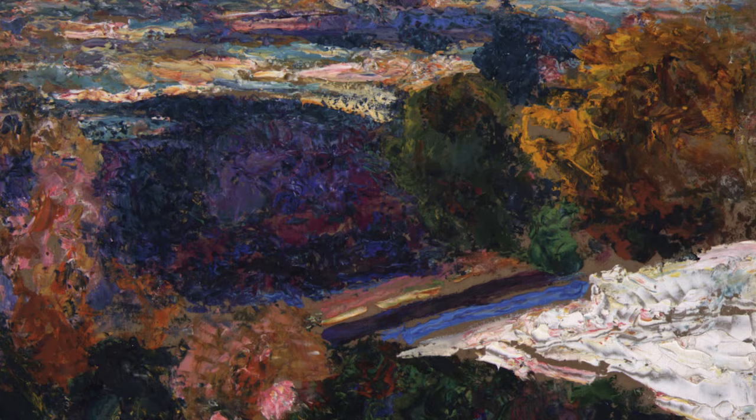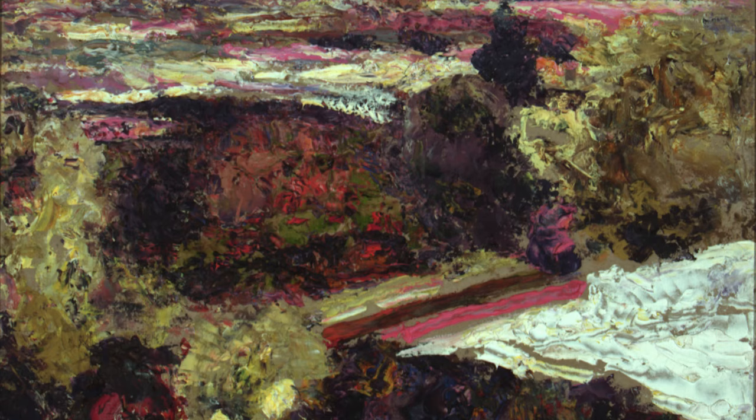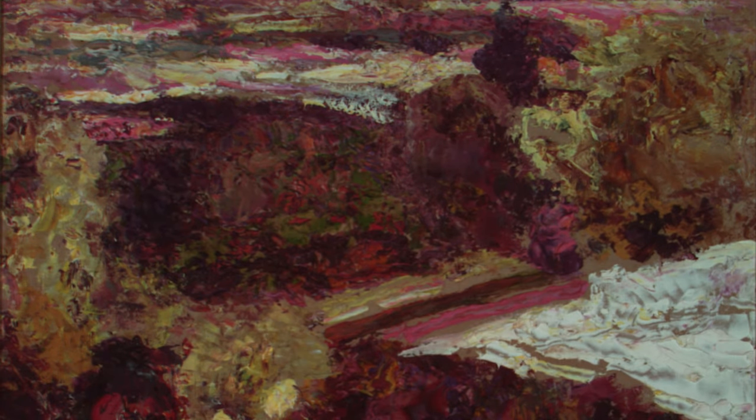We look for the similarities or the inconsistencies in colour between the photos of the palettes and those of the paintings in a group of corresponding wavelengths. If all visible colours have the same colour correspondence in both pictures, whether it is in false colour infrared type 1 or 2, then this means that the pigments used are very similar, even identical, and mixed together in similar proportions.